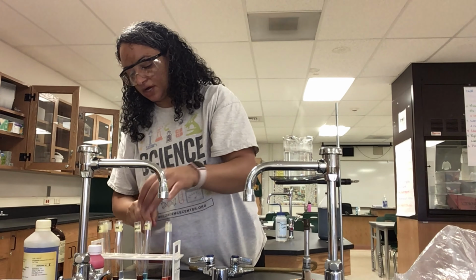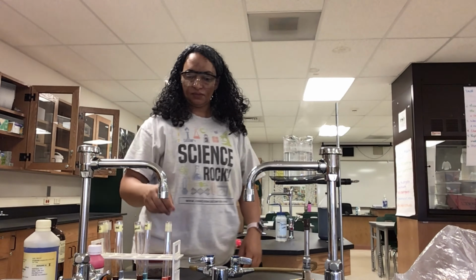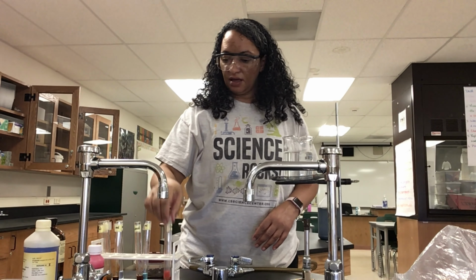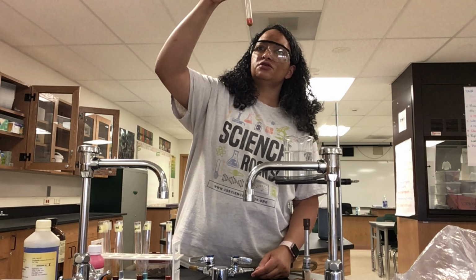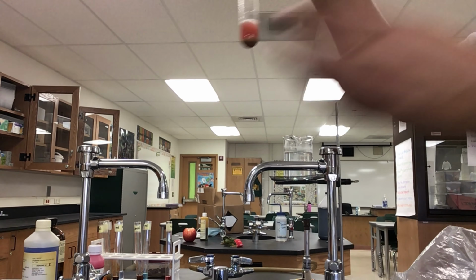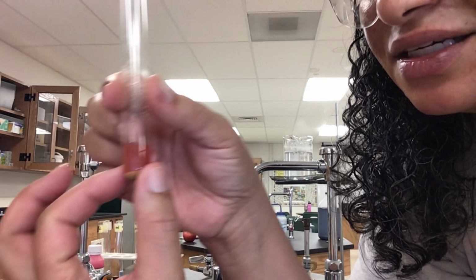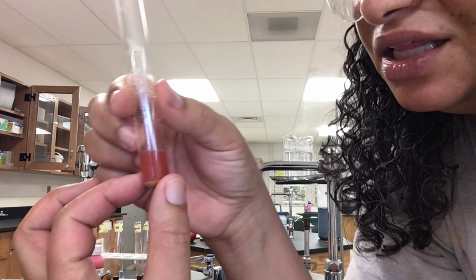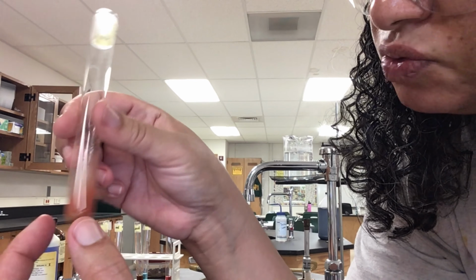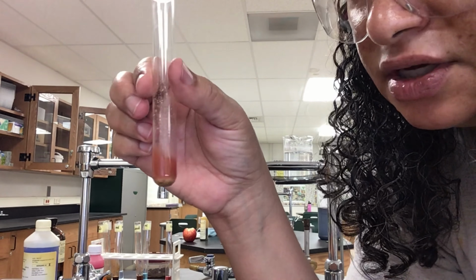And then our last one is our lipid test. Let's see how it's doing. So our control, we still have a nice red response. So this one is a little harder to tell, and let me bring it a little closer. But basically the fat kind of gathers at the top, and so we get a nice little layer of that, but it's really hard to see on video. But this is definitely a change between our control. So we do see some of the stuff gathering at the top.